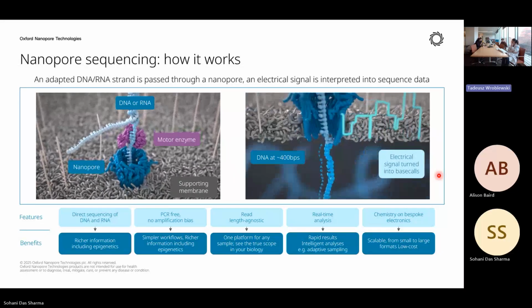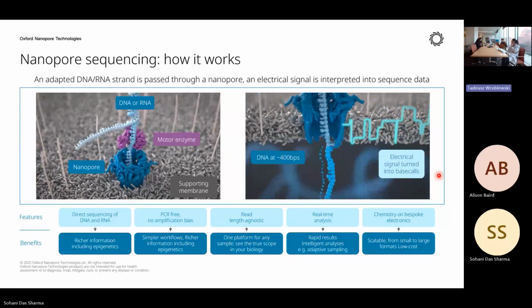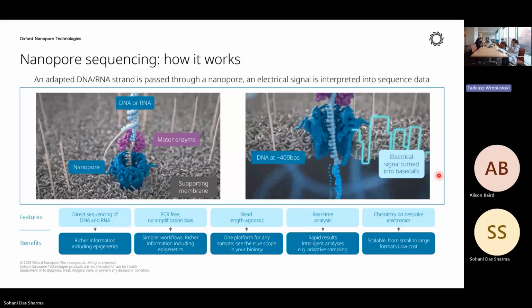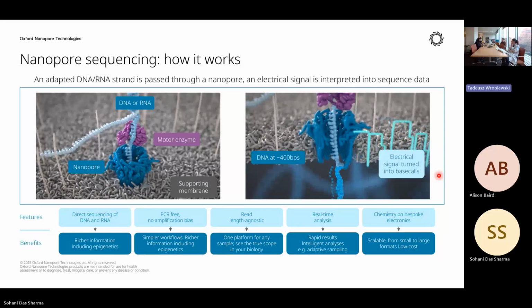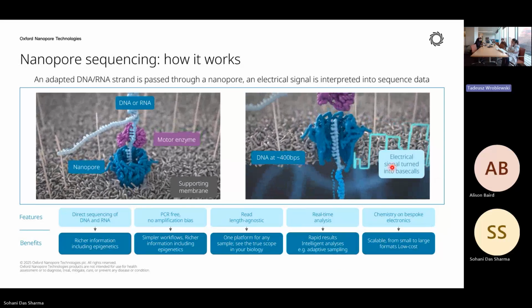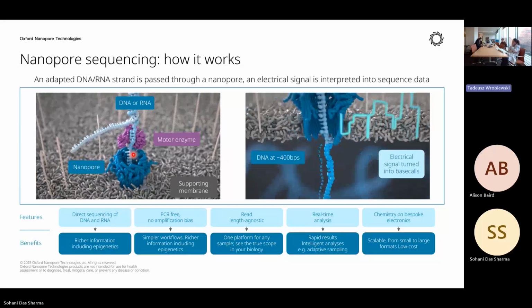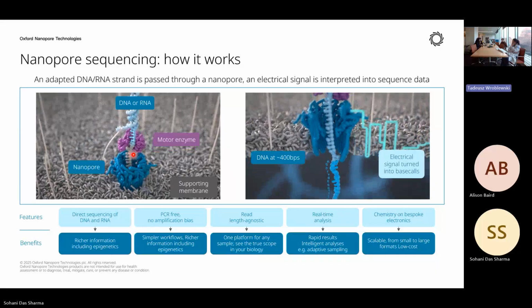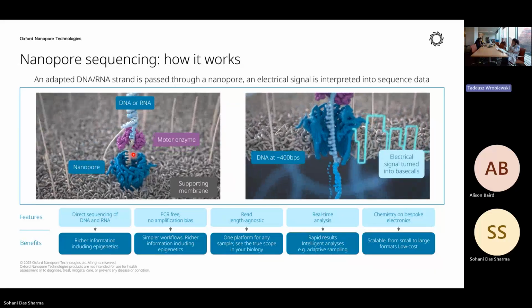I think yesterday I was showing a diagram, which is a single nucleotide region. So it is also acting as a tethering platform. It is helping the DNA or RNA to come in close proximity with the nanopore. And for RNA, it is controlling the speed. There is no cDNA library there. Even if the starting material is RNA, there's no cDNA.